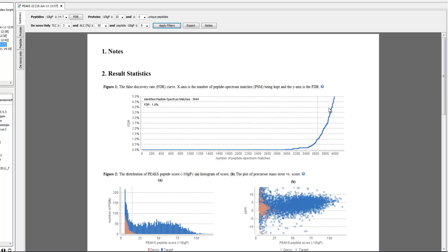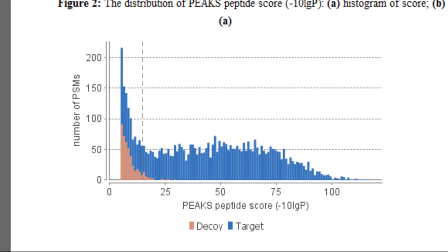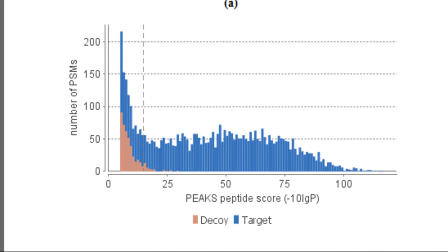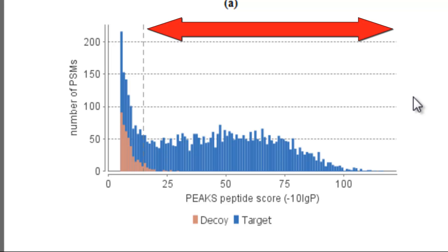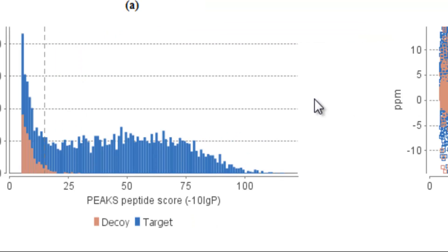Let's now examine two figures from the summary report. First, this bar graph shows the score distribution of the target and decoy hits. PEAKS uses an enhanced target-decoy method to estimate the false discovery rate. Here, we observe that there are very few decoy hits above the score threshold, indicating highly accurate results.